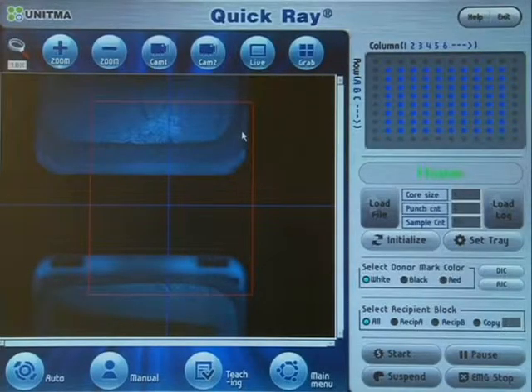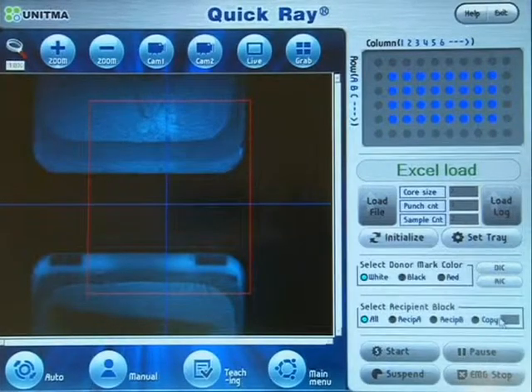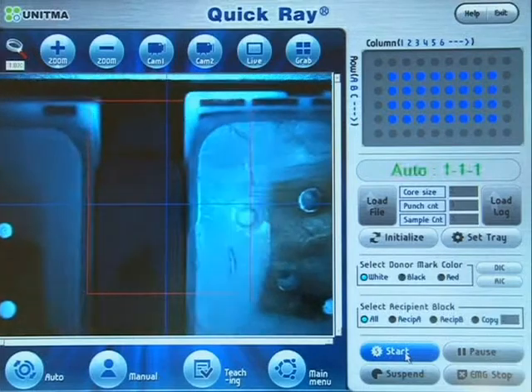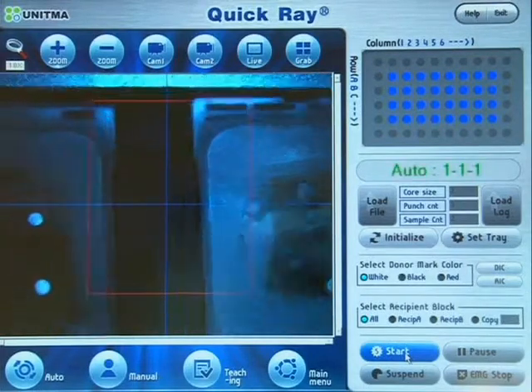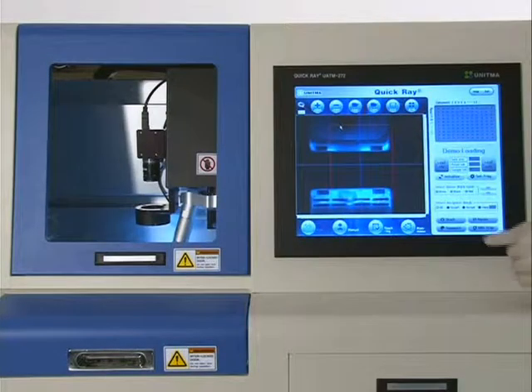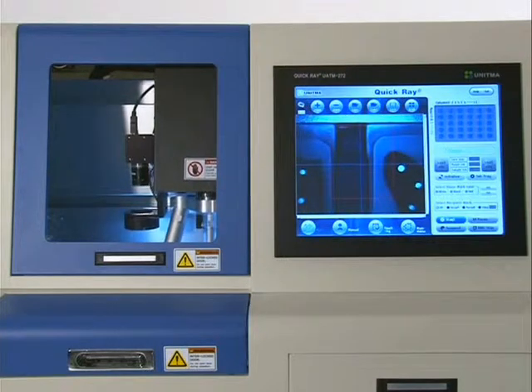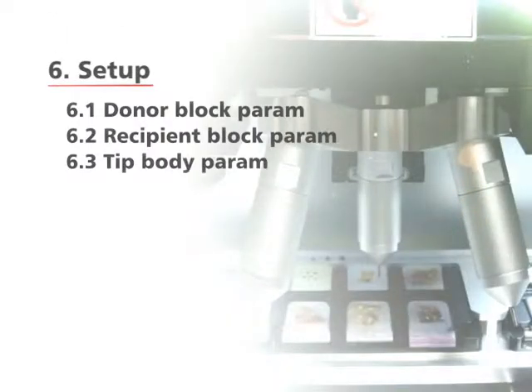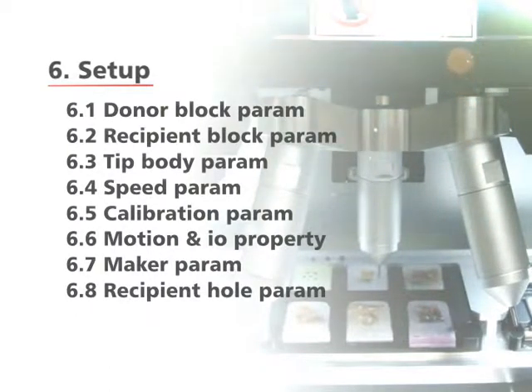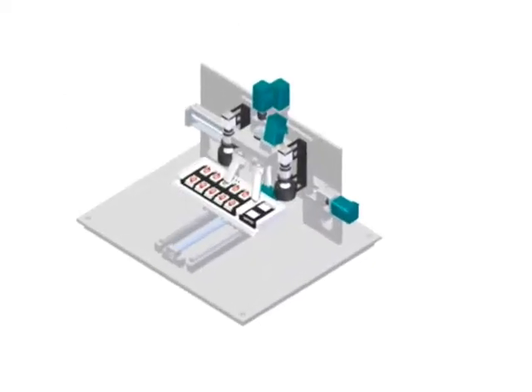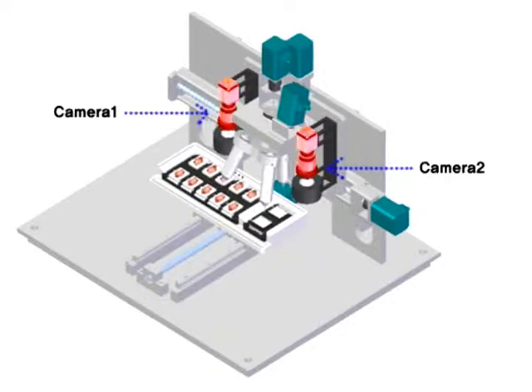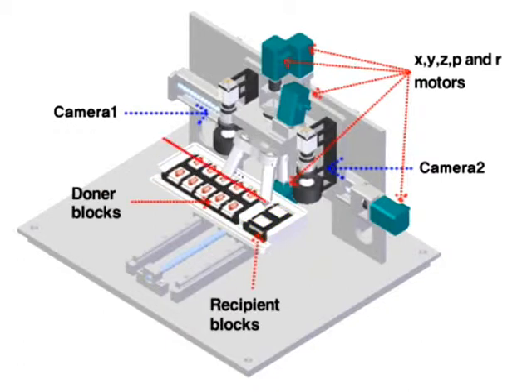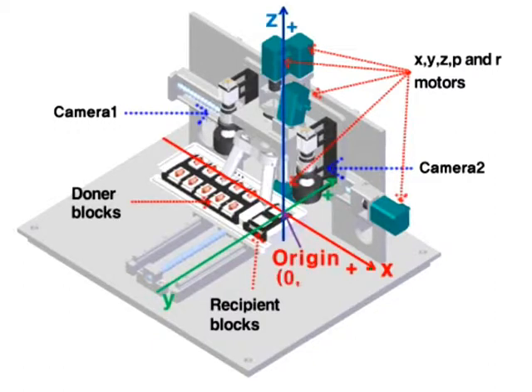Manual mode manually moves a tissue sample from a donor block to a recipient block. Teach mode is activated only during auto operation — this occurs when the search for a tissue sample in a donor block fails or when the search for a recipient block hole fails; there are menus for each donor block and recipient block. Demo mode displays all the steps from the extraction of a tissue sample from a donor block to its delivery to a recipient block, for you to understand this instrument. Setup indicates the setting of the physical positions of the two vision recognition cameras, five-axis motion controller, starting point sensor, donor block, recipient block module, and each component, as well as the setting of constants and variables that affect the camera image processing.